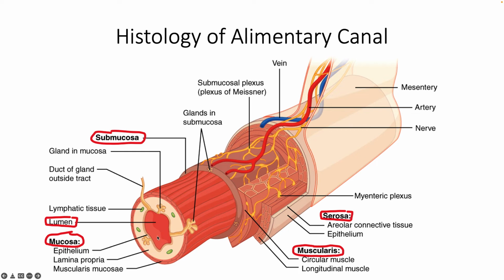The immediate tube lining is called the mucosa. There are a couple of different layers of the mucosa, but we're just concerned with identifying it as mucosa. It's distinguished by this columnar epithelia. Right outside the mucosa, we have the submucosa. We're going to have some vasculature supplying the submucosa as well as some nerves, helping with parasympathetic innervation.